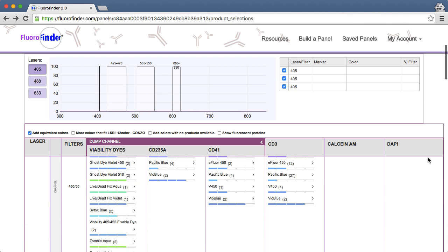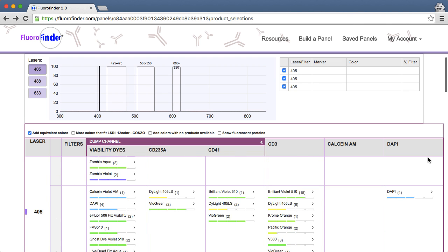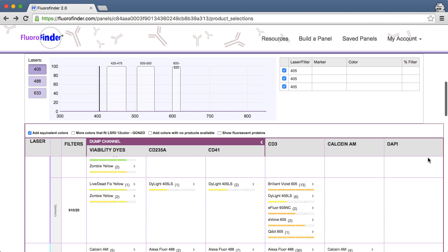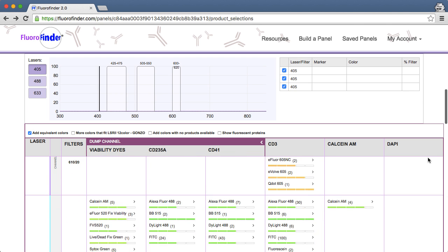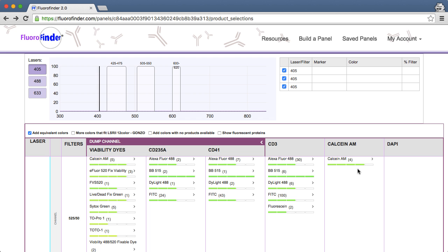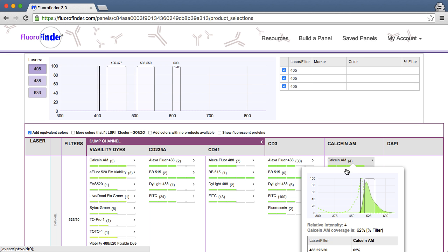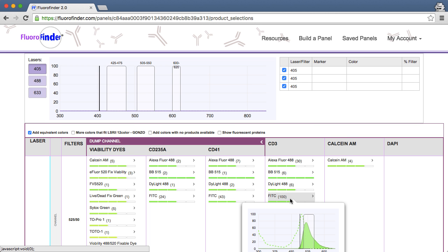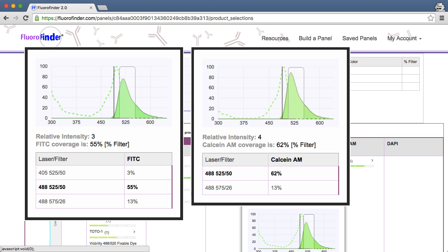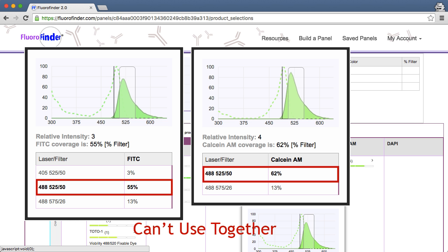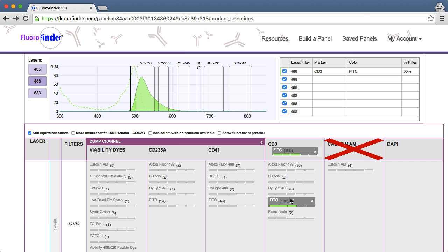In step 3, it's crucial to assign your viability dye to a channel. FluoraFinder blocks a channel after a fluorochrome is selected, thereby preventing the selection of additional incompatible dyes. For instance, if you don't choose a product for Calcein-AM, FluoraFinder will allow you to select FITC for CD3.